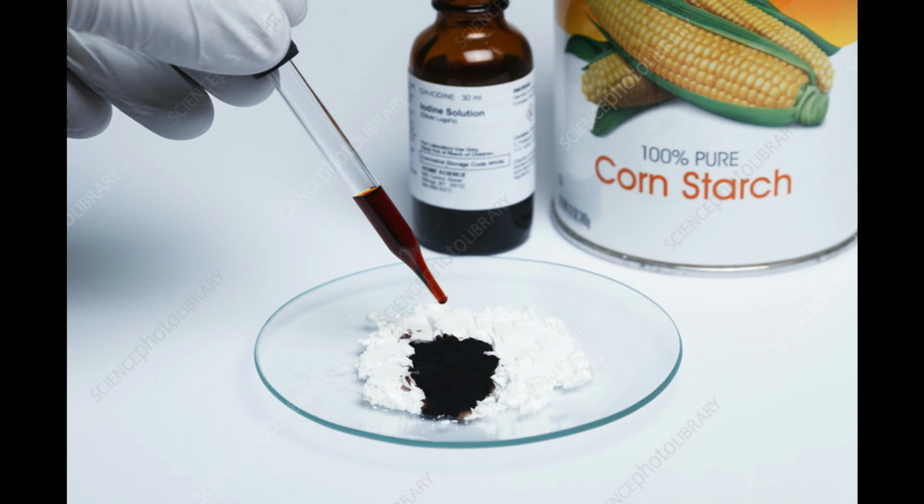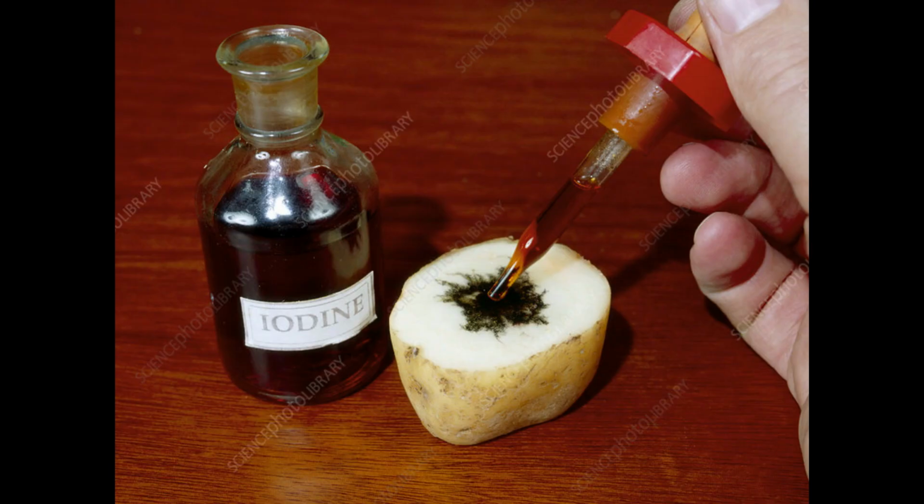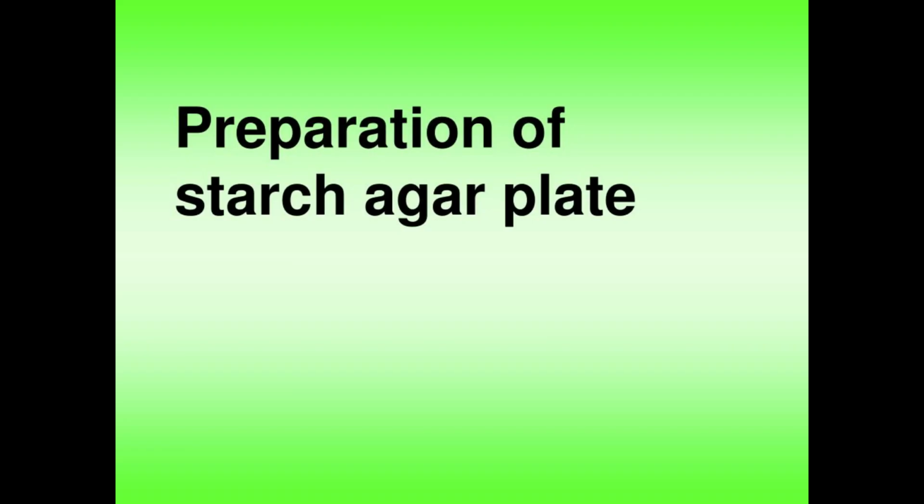And as we know, a very important test for the presence of starch is iodine. Iodine very quickly reacts with starch and gives a blue-black complex. If there is no starch, no blue-black complex will be formed. So let's start this experiment of starch hydrolysis by bacteria.